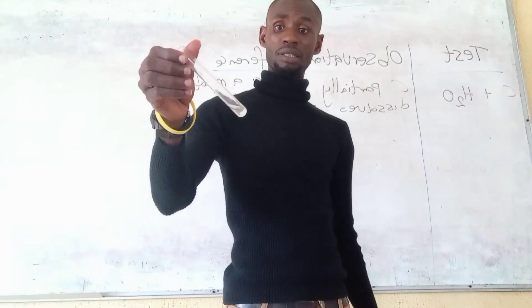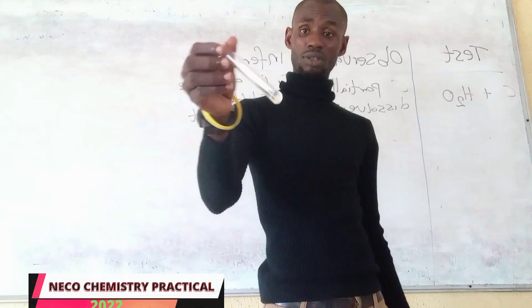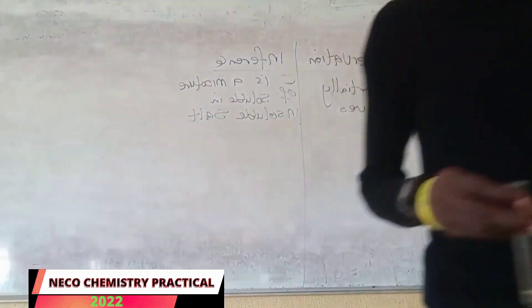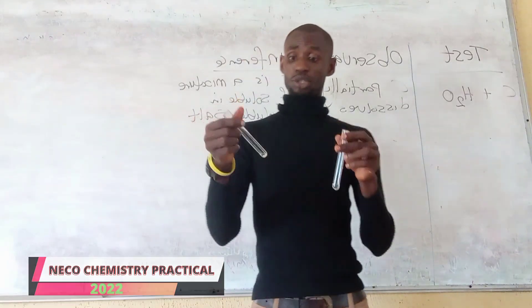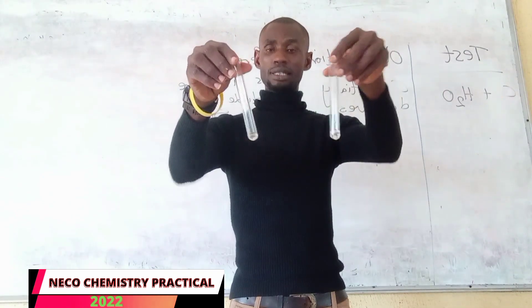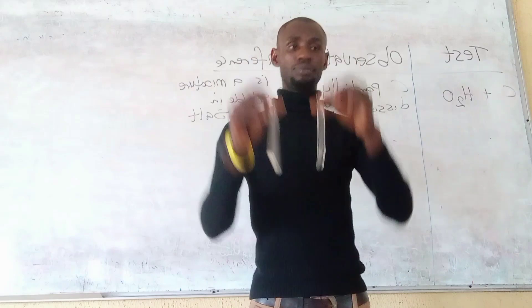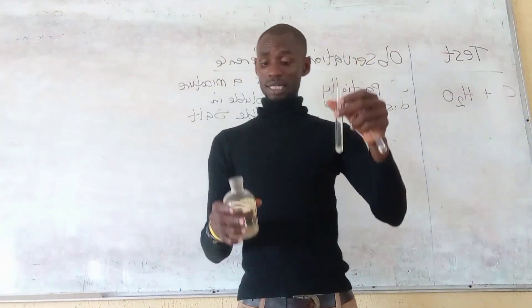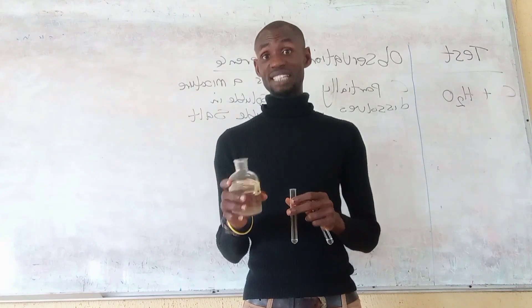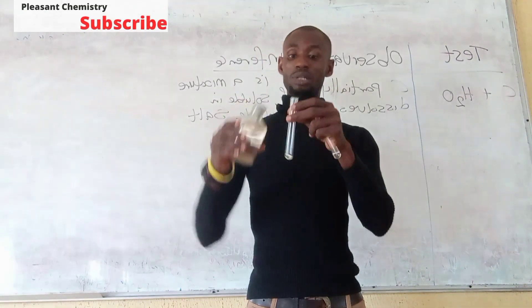We are going to divide the dissolved residue solution into two portions. I have dissolved the residue with hydrochloric acid and divided it into two. In the first portion, I am adding sodium hydroxide (NaOH). Remember, we use sodium hydroxide to test majorly for cations.